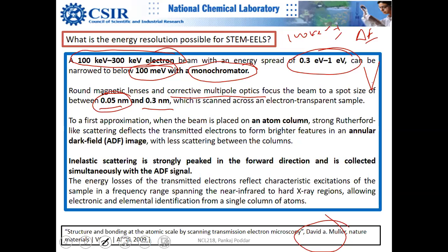You see what it means? This is crazy. The beam size here is crazy. This one is acceptable, 3 angstrom. This is half an angstrom actually. This is basically the radius of a hydrogen atom, right?